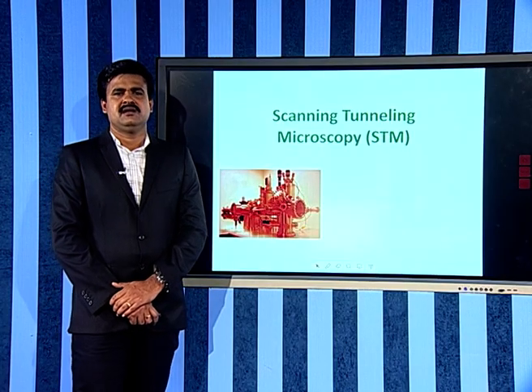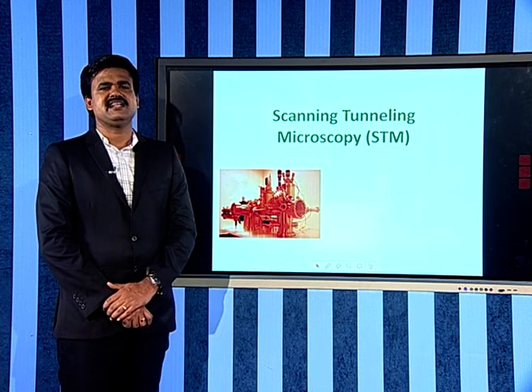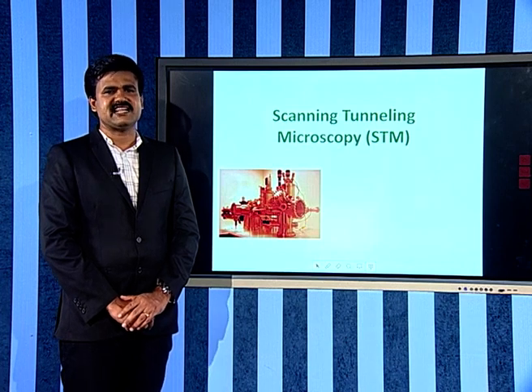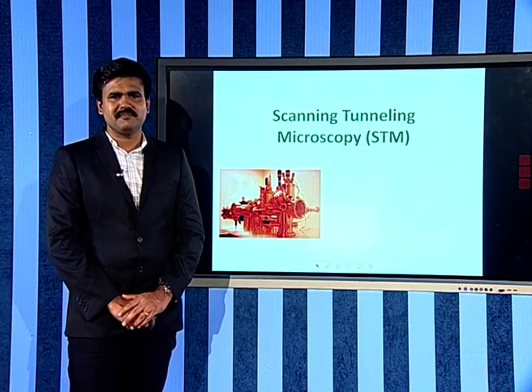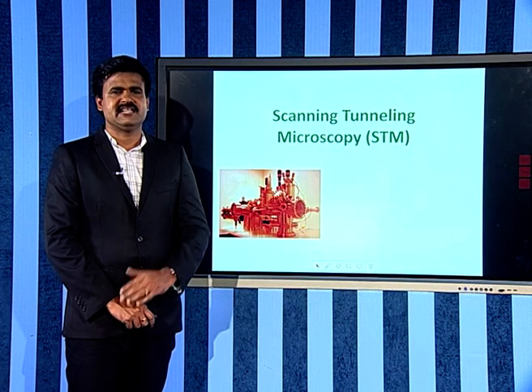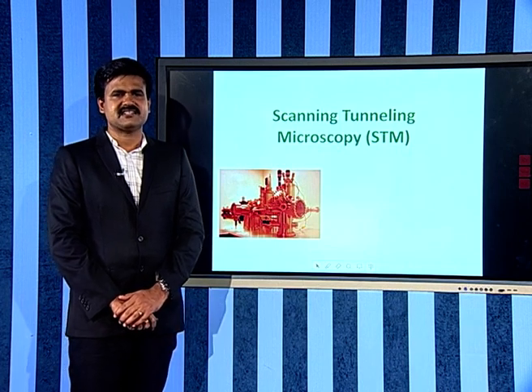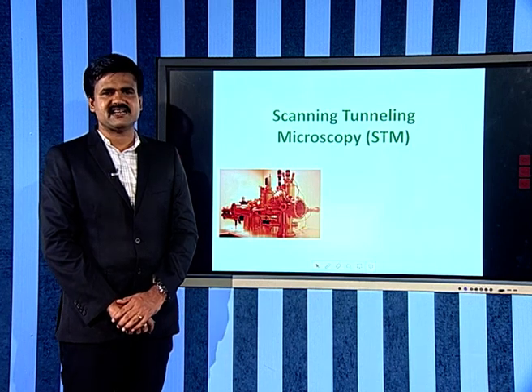Now, another important characterization procedure. This is scanning tunneling microscopy. Acronym is STM. Let us have the details on instrumentation and characteristic features of scanning tunneling microscopy.